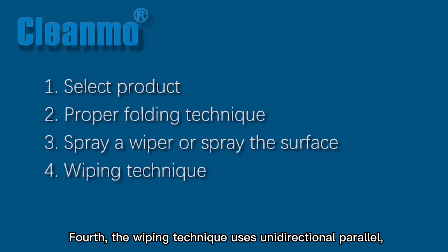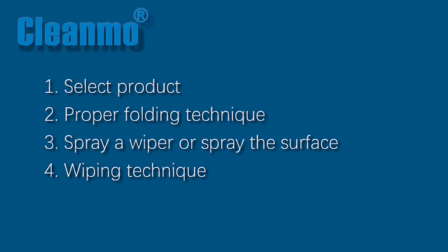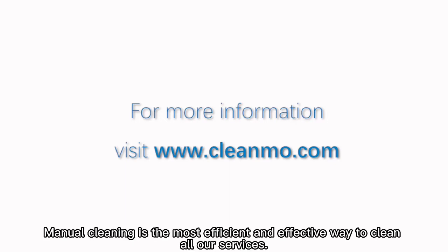4th, the wiping technique uses unidirectional, parallel, overlapping strokes for even coverage and always wipes from the cleanest to the dirtiest area. Thank you for your time and attention. Manual cleaning is the most efficient and effective way to clean all our surfaces.